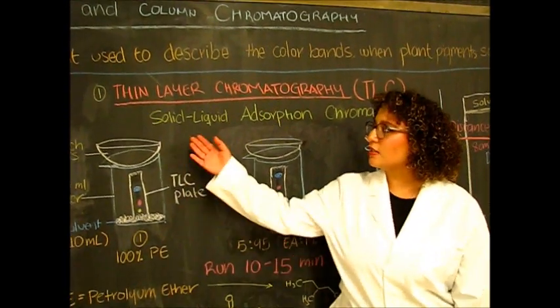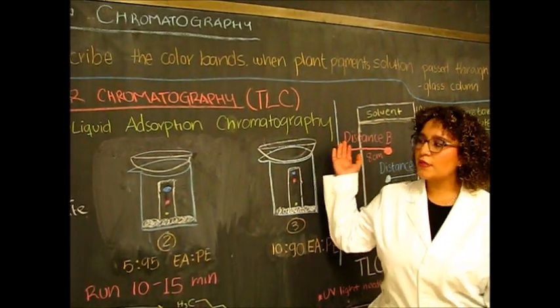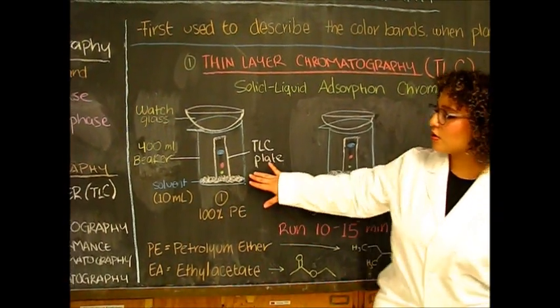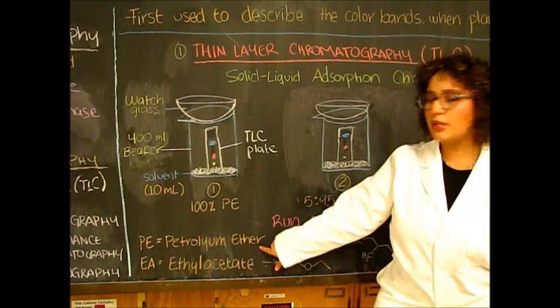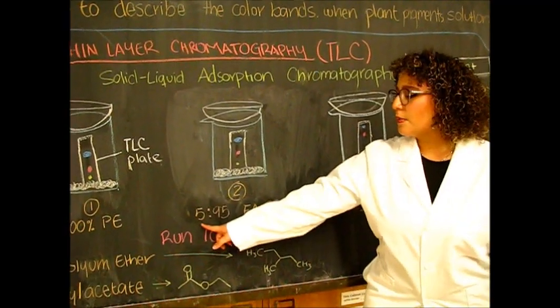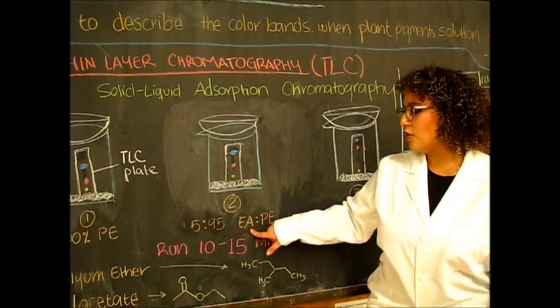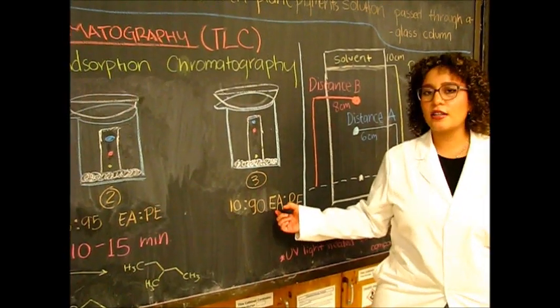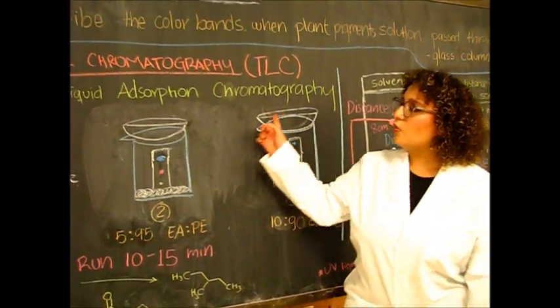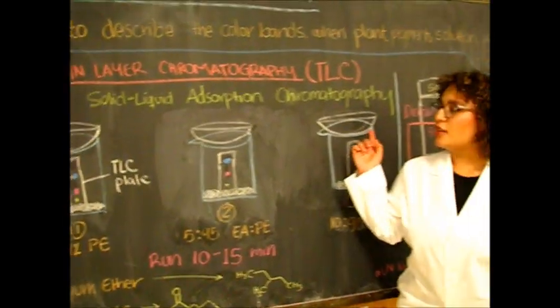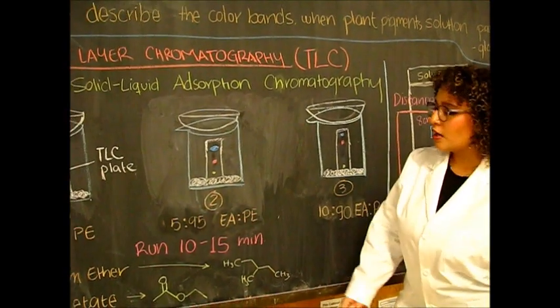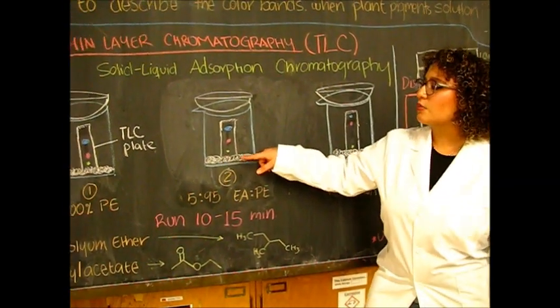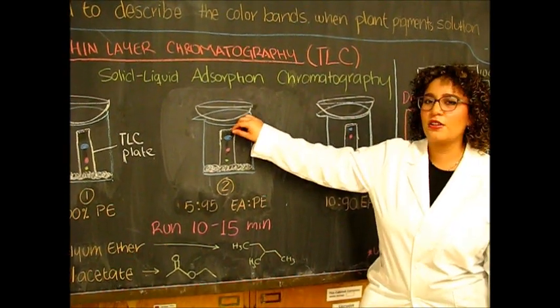For thin layer chromatography, this is a solid liquid adsorption chromatography technique. We will be running three experiments in three different 400 mL beakers. In the first beaker we're going to add our solvent which will be 100% petroleum ether. In our second beaker we're going to be adding 5% ethyl acetate and 95% petroleum ether. And for our third beaker we're going to have 10% ethyl acetate and 90% petroleum ether. We're going to be using watch glasses to avoid evaporation and make sure that our environment in the beaker is saturated with the solvent. We will be running our experiments from 10 to 15 minutes but we have to keep monitoring the solvent as we shall remove the TLC plates just before the solvent reaches the top.